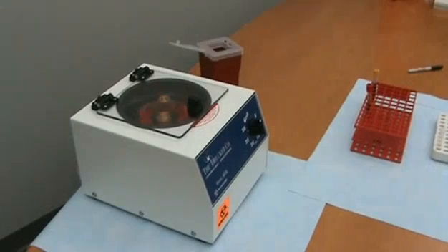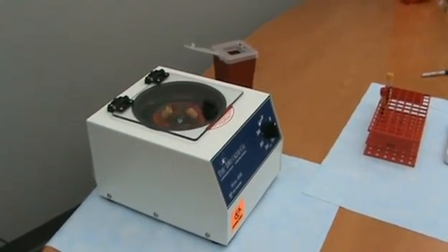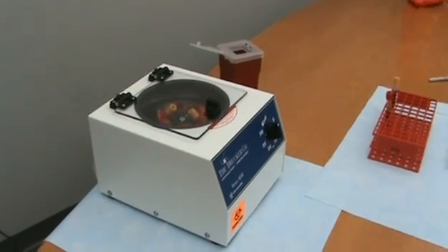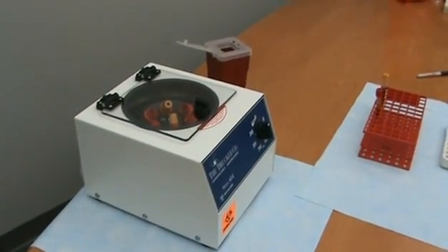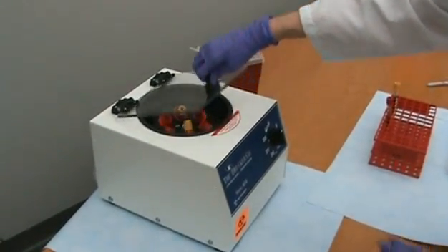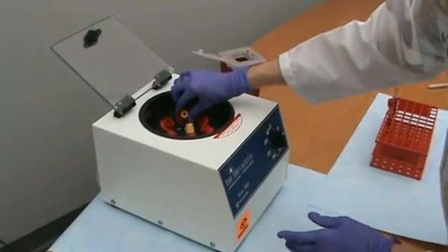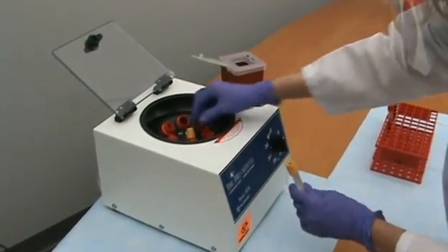Once the spin time is completed, it is very important to allow the rotor to stop completely before opening the centrifuge lid. Failure to follow these instructions could cause serious injury to personnel. Be conscious of any possible broken tubes. If breakage has occurred, view the safety section of this video or refer to the flip cards for further instructions.